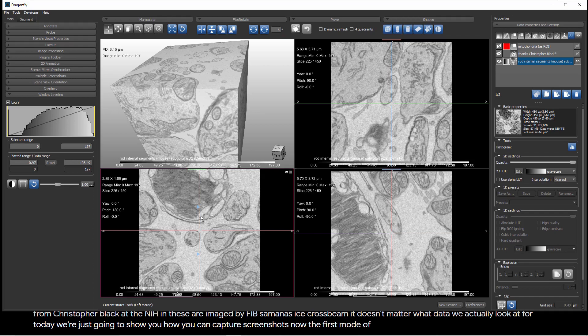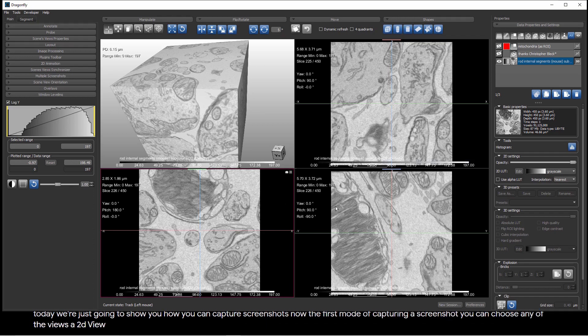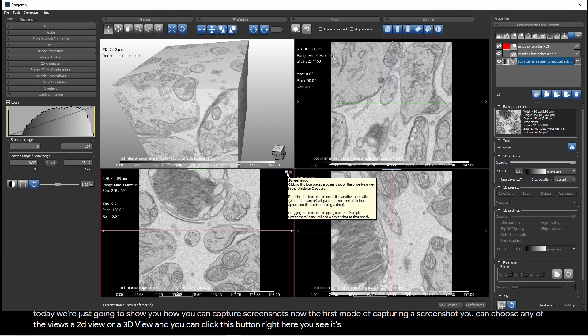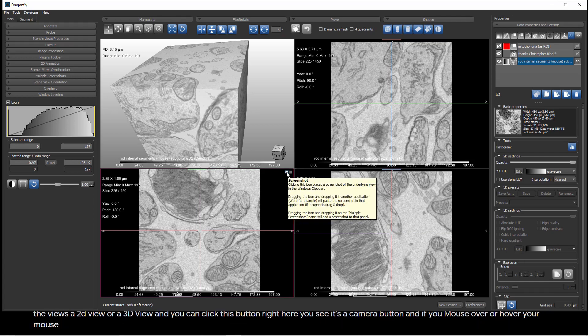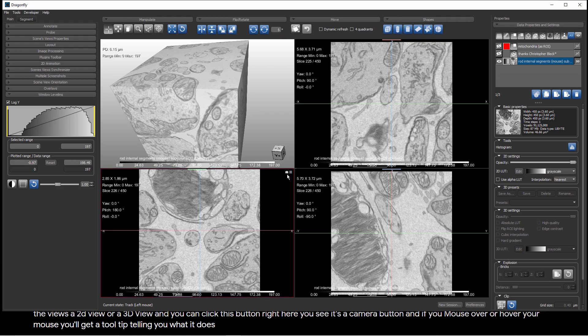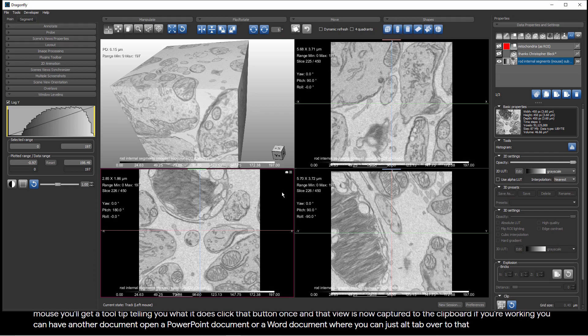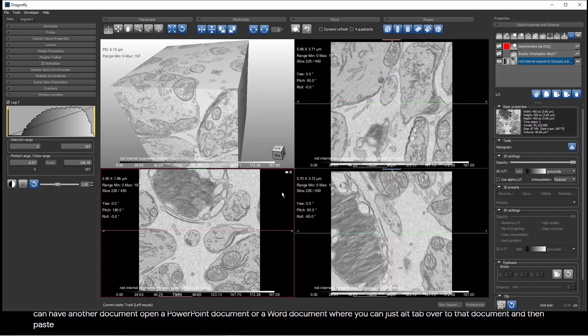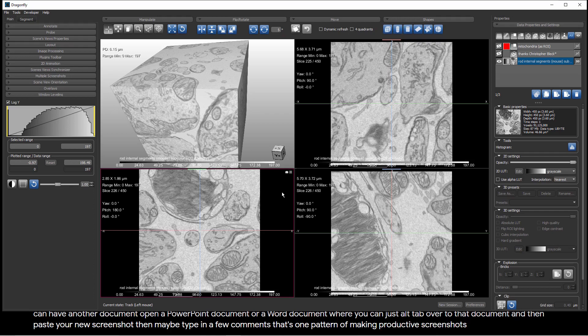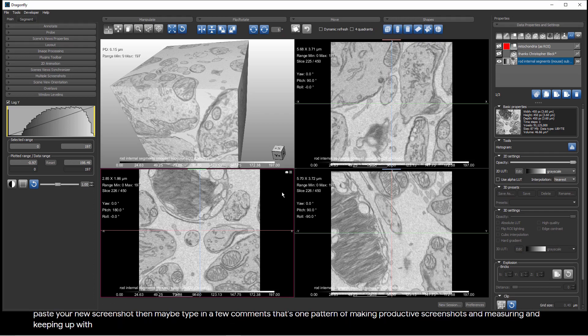The first mode of capturing a screenshot, you can choose any of the views, a 2D view or a 3D view, and you can click this button right here. You see it's a camera button, and if you mouse over or hover your mouse, you'll get a tool tip telling you what it does. Click that button once, and that view is now captured to the clipboard. If you're working, you can have another document open, a PowerPoint document or a Word document, where you can just Alt-Tab over to that document and then paste your new screenshot, then maybe type in a few comments.